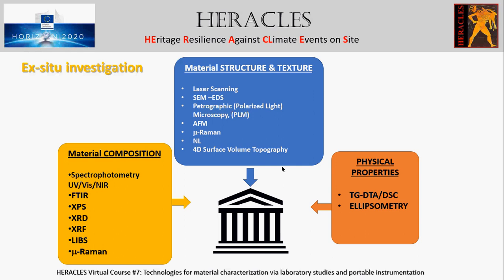So for the material composition study, several techniques can be used. For instance, spectrophotometry, which is considered a technique for molecular characterization. It is widely used as an analytical tool for non-invasive analysis of cultural materials, including pigments, paint binders, or paintings on panels, parchments, and walls, as well as on canvas and plastics. This technique is considered non-destructive and the sample recuperation is full.